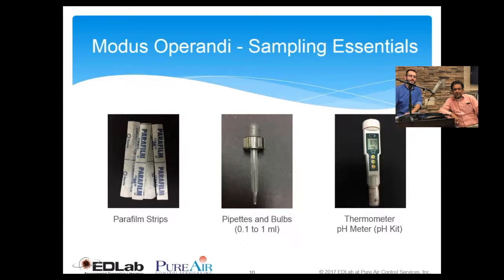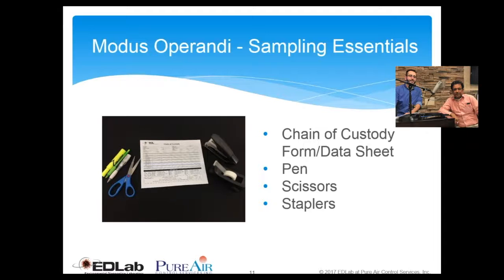So you can see that we can use various tools. In this particular slide, you can see that there is a thermometer and pH meter combined. And that's very handy. It comes very handy, and you can easily obtain the water and measure the temperature and the pH from that water. Okay. What are a few more things that people can use in the field for sampling?